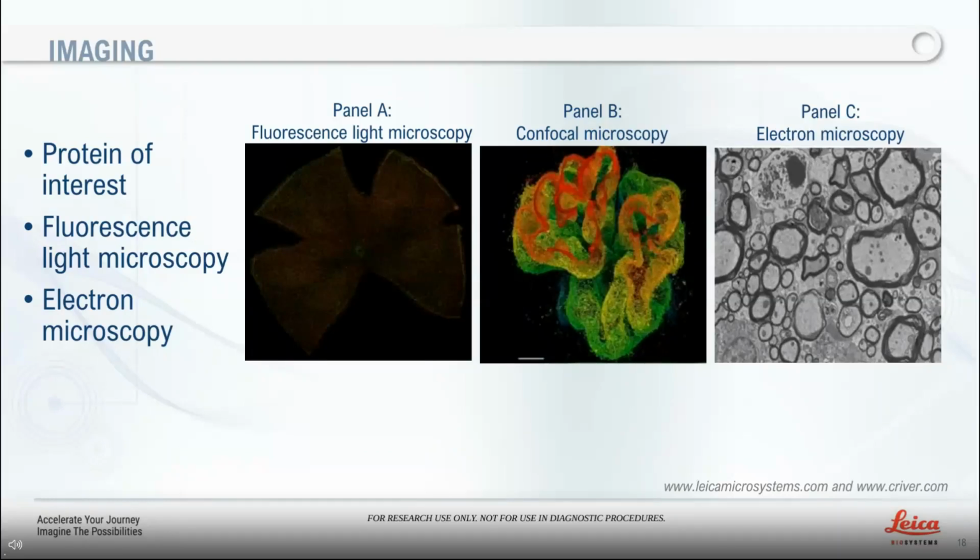However, another strategy is to permeabilize chemically fixed cells or tissues and treat them with antibodies bearing a fluorescent compound. Just to mention a few common fluorescent proteins and dyes: GFP, DAPI, Alexa Fluor, mCherry, and others. These techniques include immunohistochemistry, fluorescent in situ hybridization, and enzymatic degradation. And honestly, the first step for successful fluorescent protein detection is having good tissue preservation.